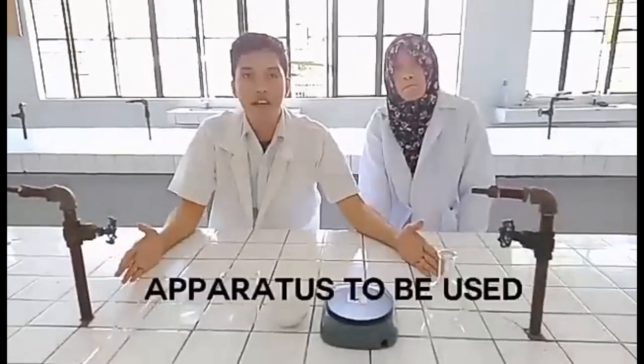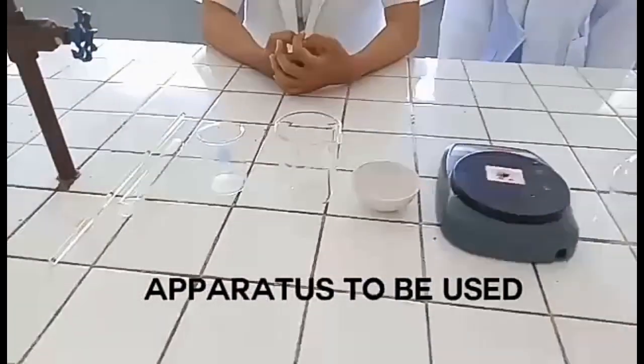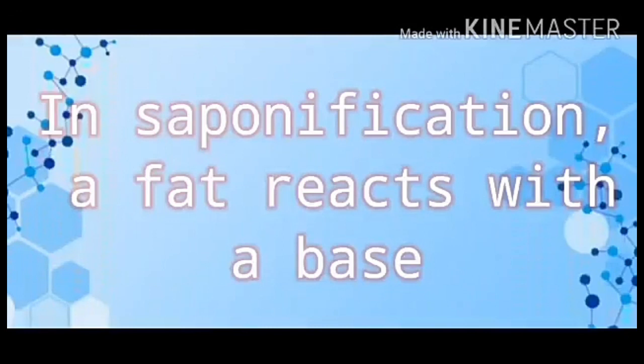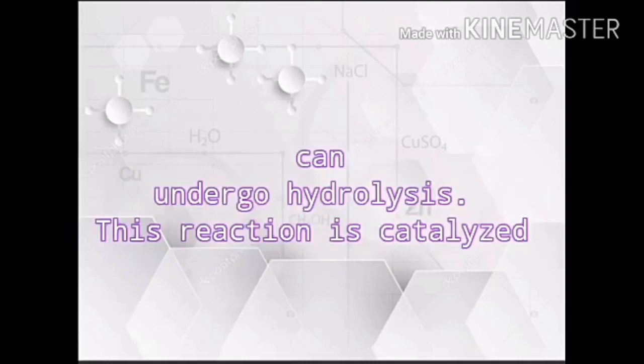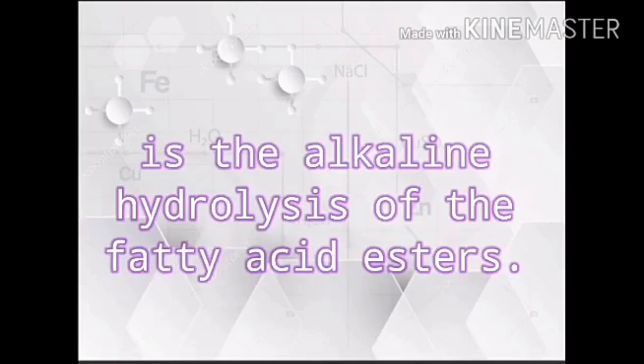So these are the apparatus to be used in saponification. In saponification, a fat reacts with a base to form glycerol and soap. Lipids that contain fatty acid ester linkages can undergo hydrolysis. This reaction is catalyzed by a strong acid or base. Saponification is the alkali hydrolysis of the fatty acid esters.